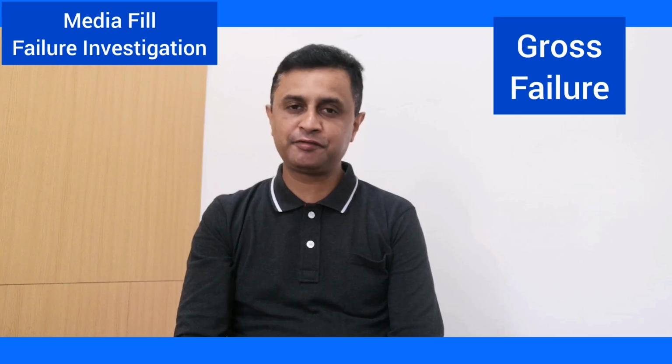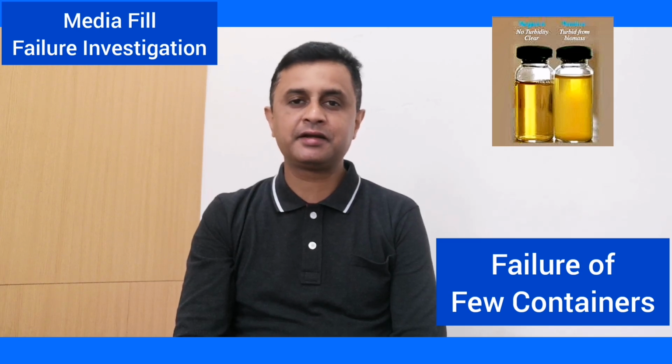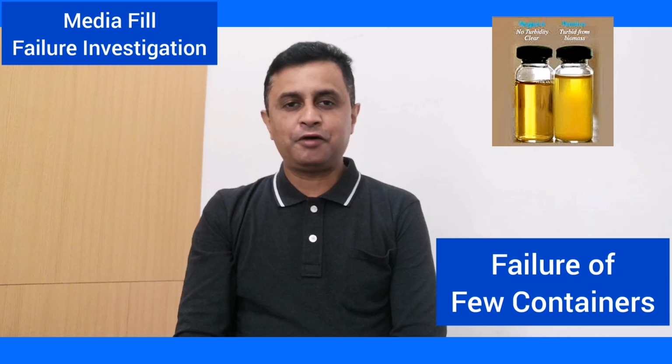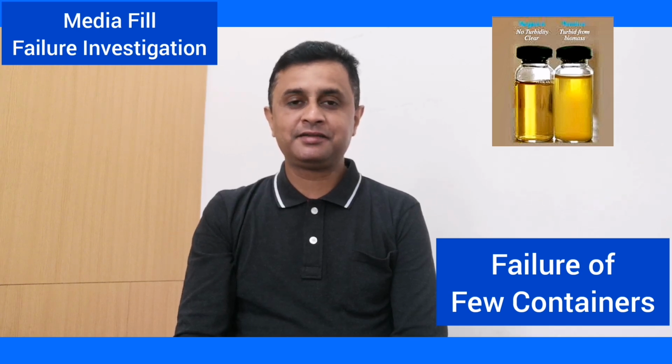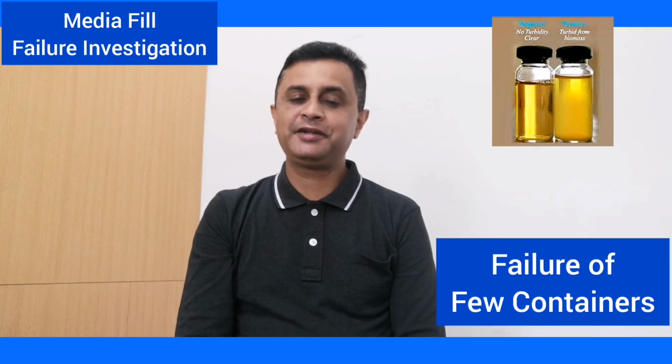In my previous video we discussed the gross failure of media fill, and in this video we will discuss the failures which are not gross. For example, we are getting 2, 3 or 4 vials intermittently having contamination during the entire course of media fill. So we will understand how we can investigate these intermittent failures with a few contaminated units during the media fill.